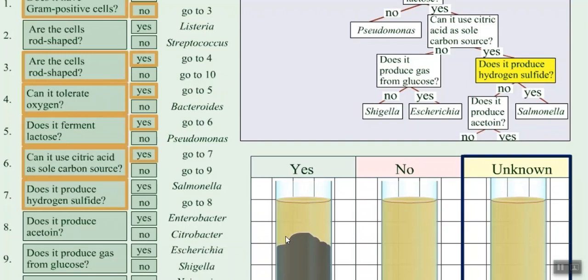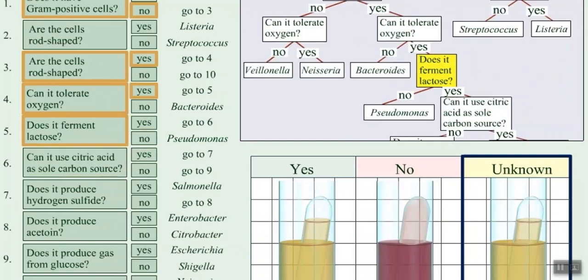Part D: how is fermentation of lactose determined? That was just from the video, and we also talked about this as well. We can go backwards to this one here. So lactose, glucose, sucrose, maltose, there are a host of different sugars that we're going to use in our unknown testing. What we're going to be looking for is a color change, because this red color is how all the test tubes show up. Before they're ever inoculated, they're going to be this red, reddish, pinkish sort of color.